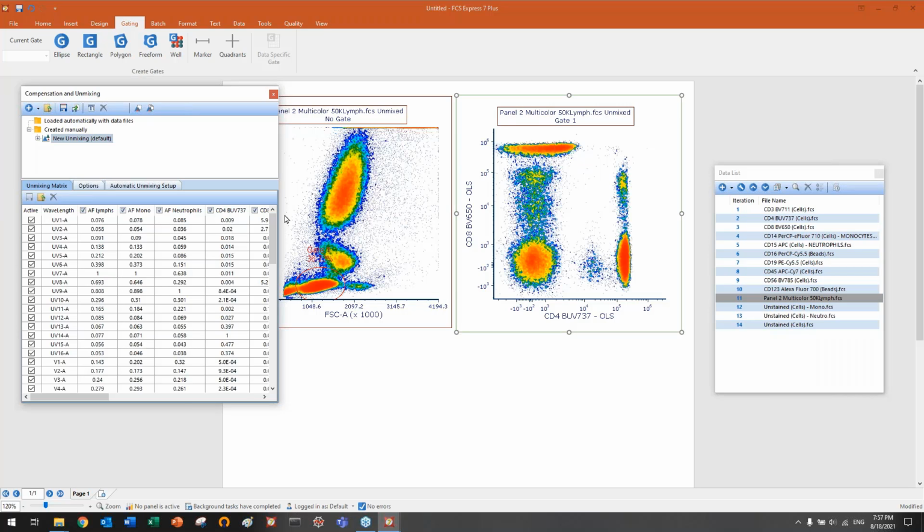Because if two autofluorescences are really similar, if they are not different enough, measuring all of them might be detrimental for the unmixing. Ideally, it's the same thing as trying to unmix two very similar dyes. In that case you might see issues.